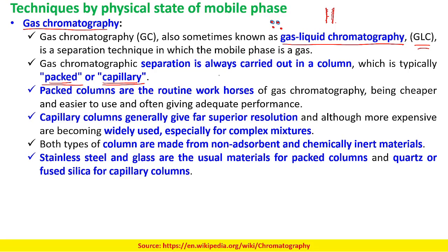So in GLC, the packing powder is coated with a thin layer of the solvent, which acts as the stationary phase.